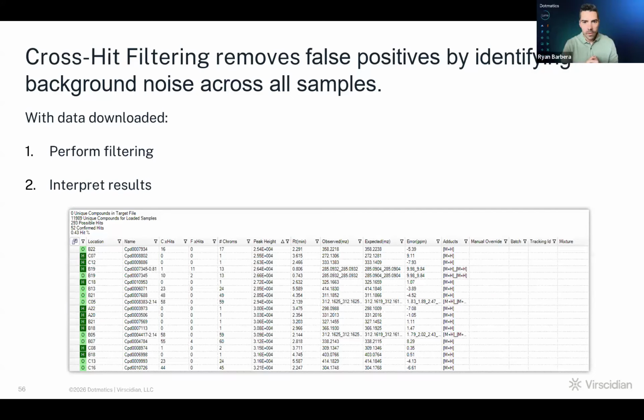Okay, great. And then we got one last one here. What vendor systems are currently supported? So I would say first and foremost, for ASMS specifically, you'll want to do this on a high resolution mass spectrometer, right? So anything from a QTOF, a high res QTOF, or certainly Orbitraps, FTMSs.